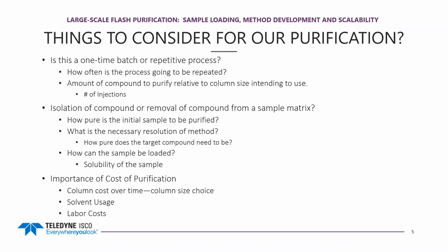The other thing to consider when you're doing your large scale is your solvent usage. How am I disposing of the solvent that I'm using? What kind of infrastructure do I have, and are there limitations in the lab on the amount of solvent that I can use if I'm using flammable solvents? Because you're going to be using a larger amount of solvent with larger columns for purifications.